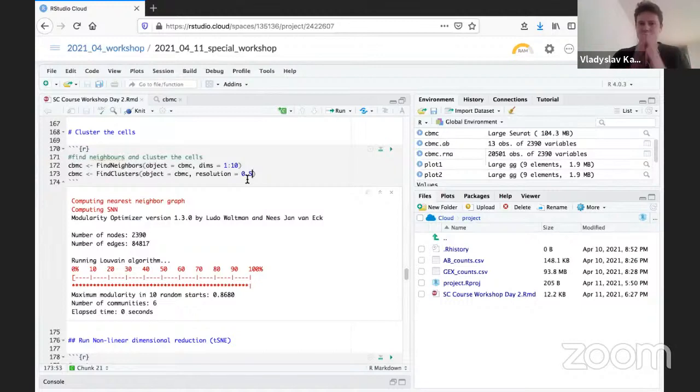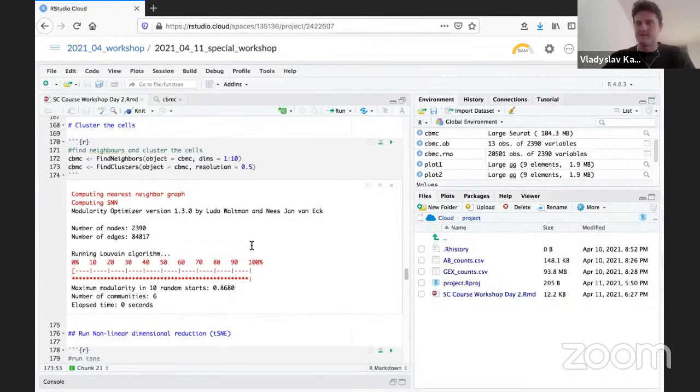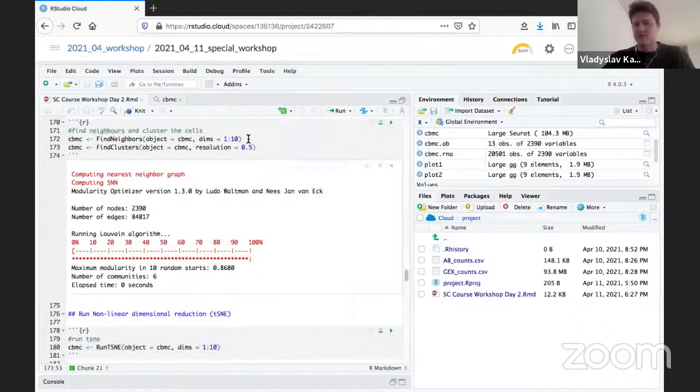You will have, in one cell type, maybe 5 clusters that don't differ much from one another. So you need to recapitulate every time which resolution you take for your data set. But for me, 0.5, 0.7, 0.8 work very nicely when I'm working with T cells.